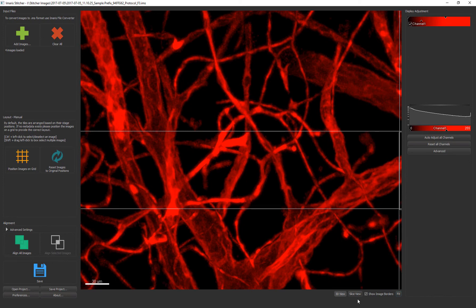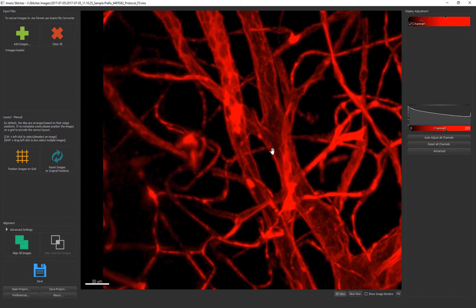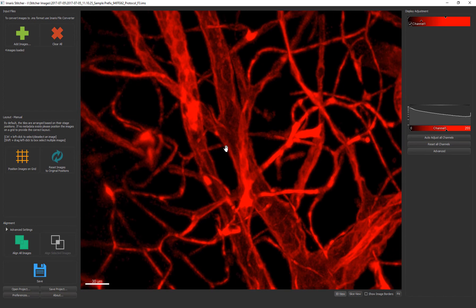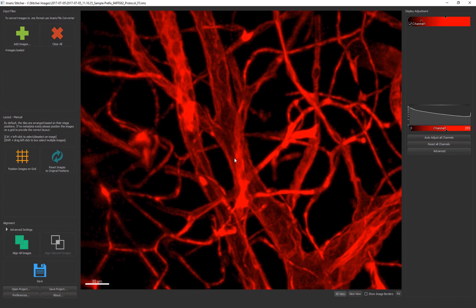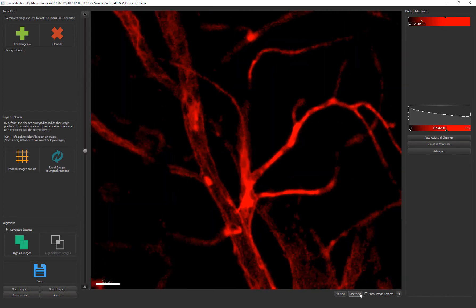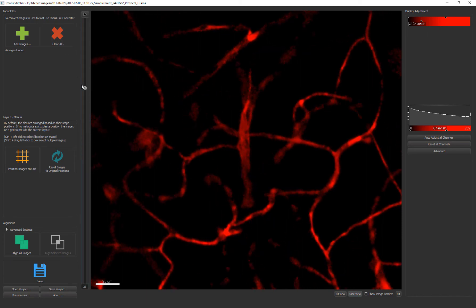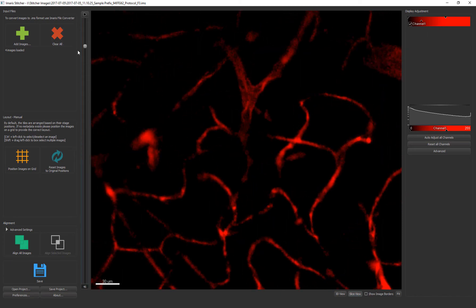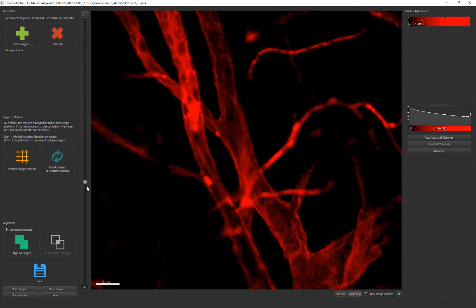After the alignment you can again inspect the tiles with the 3D view. In the bottom right hand corner you can turn on and off the image borders for each tile. You can also switch to a slice view. The slider for moving up and down through the z-planes is on the left side of the image window.